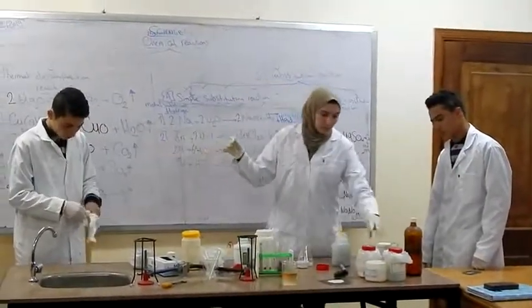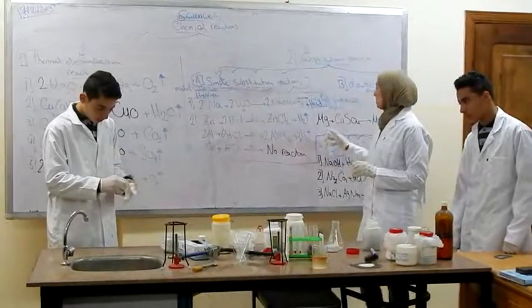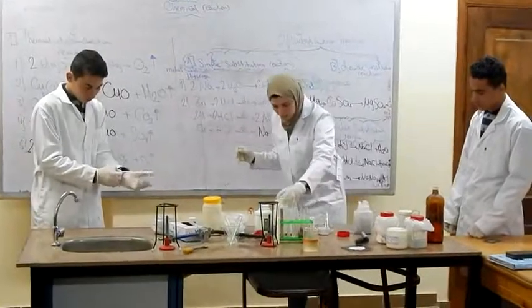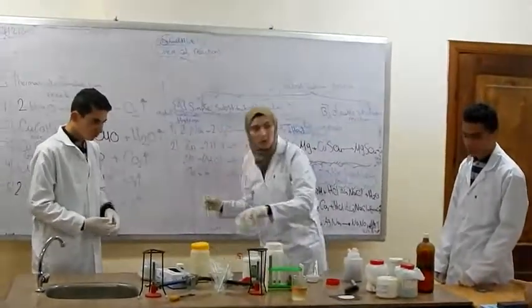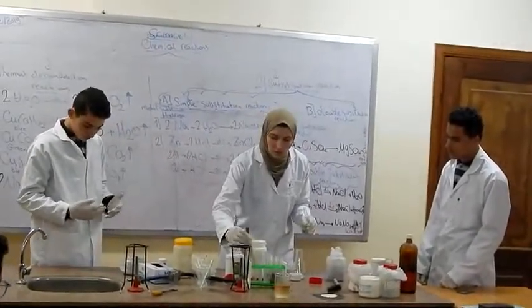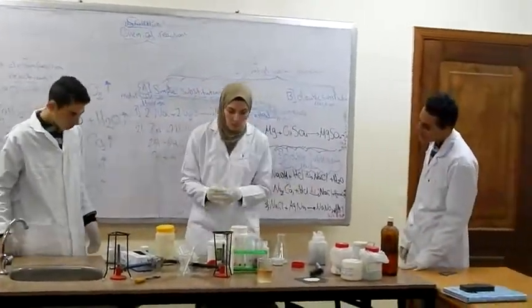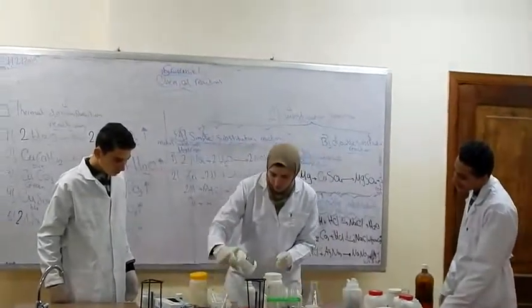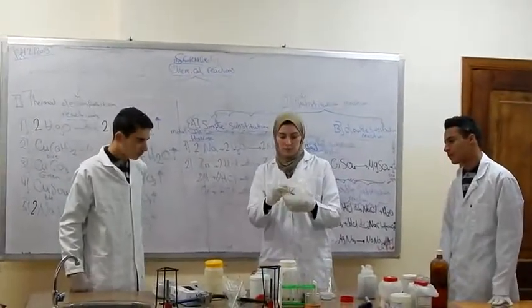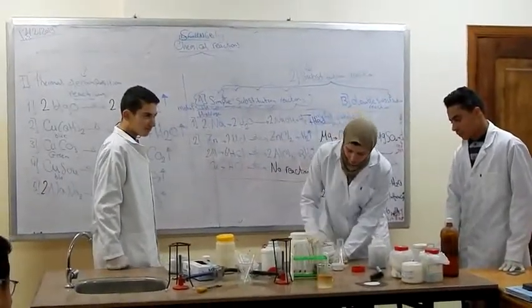And then pour some salt solution of copper sulfate.